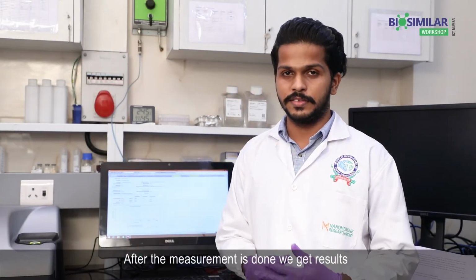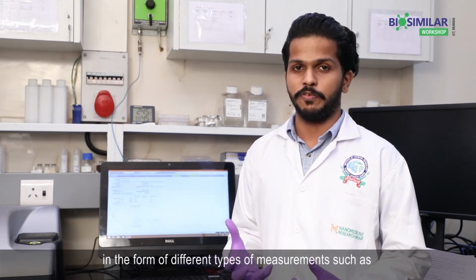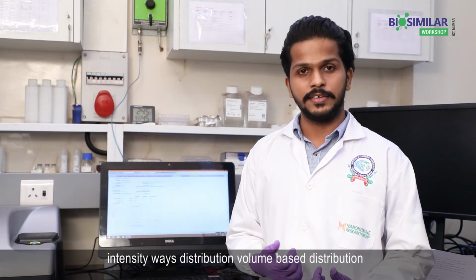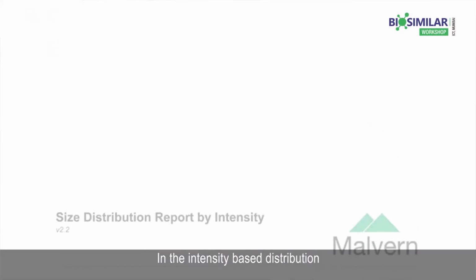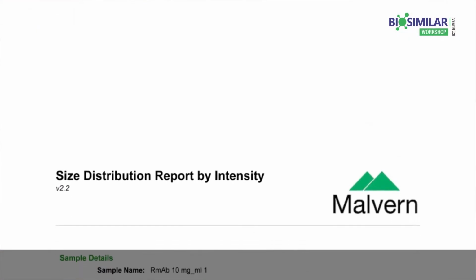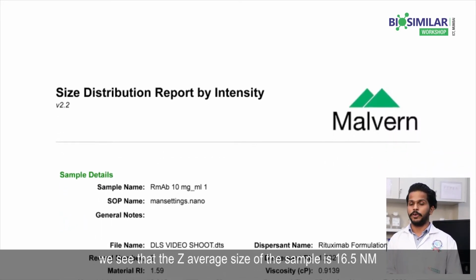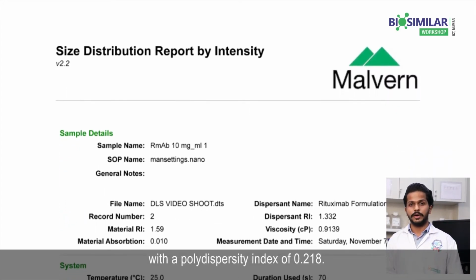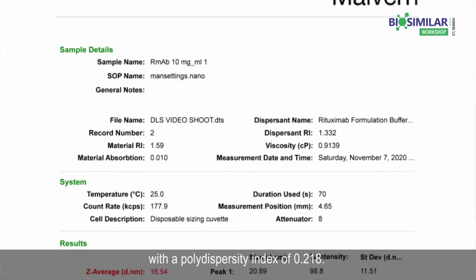After the measurement is done, we get results in the form of different types of measurements such as intensity based distribution, volume based distribution, and the correlogram. In the intensity based distribution, we see that the Z average size of the sample is 16.5 nanometer with a polydispersity index of 0.218.